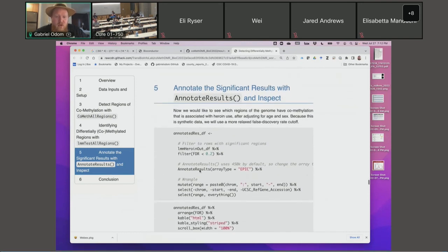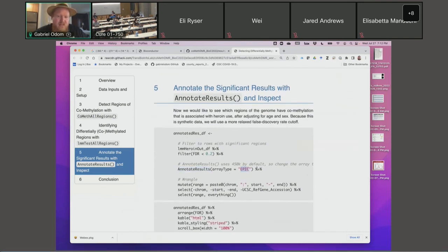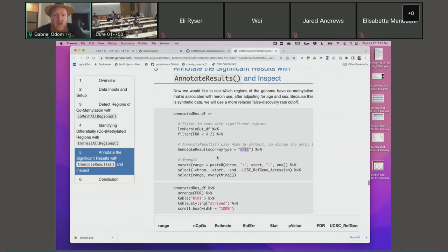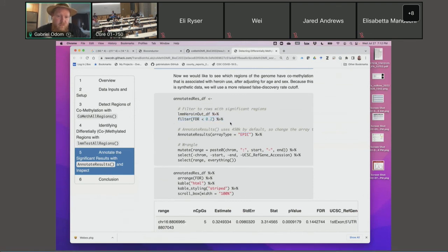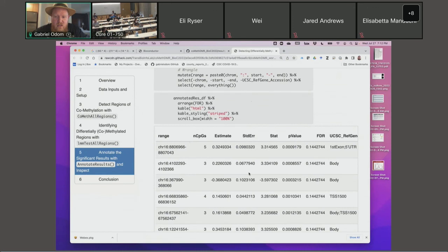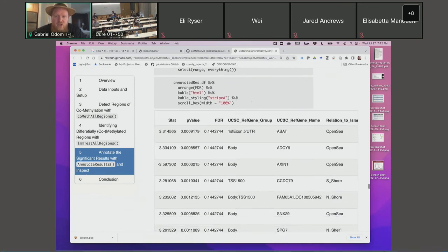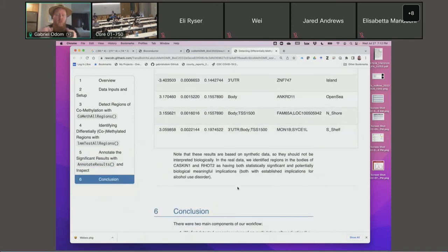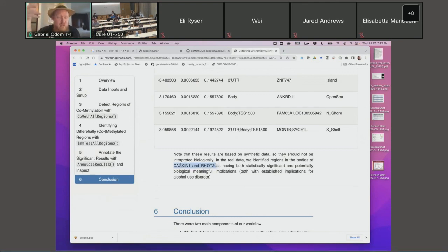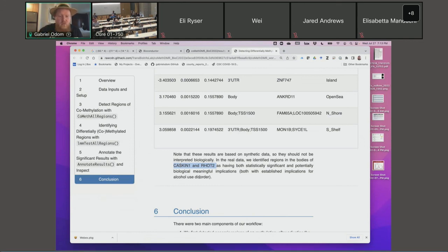We want to annotate this, so we have a function called AnnotateResults. It really just pays attention to whether or not it was a 450K array or an EPIC array. We're filtering out anything that doesn't have significance at FDR of 0.2 or whatever. So we get a couple of these results, a couple of these genes. Again, this is synthetic data. Hopefully NIDA will let us publish the data and this manuscript soon, because we actually found some really cool stuff in RHOT2 and CASKIN1 that were already found to be related to alcohol use disorder. People who are addicted to alcohol — the same gene regions have this excess methylation as people who are addicted to heroin. Really, really interesting.